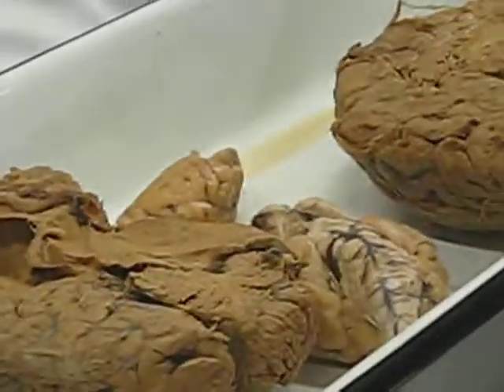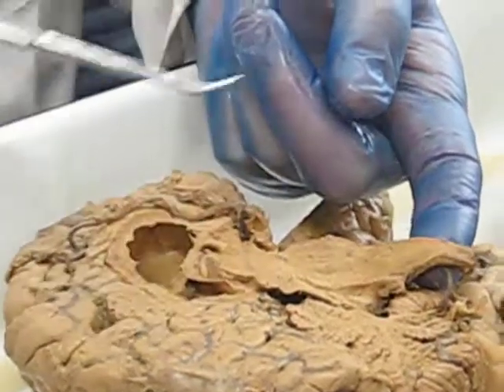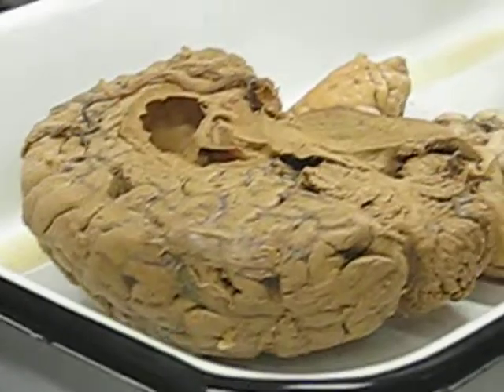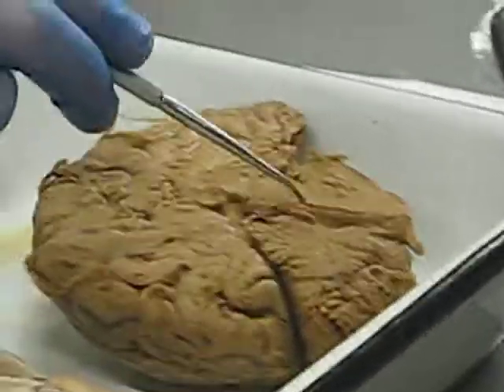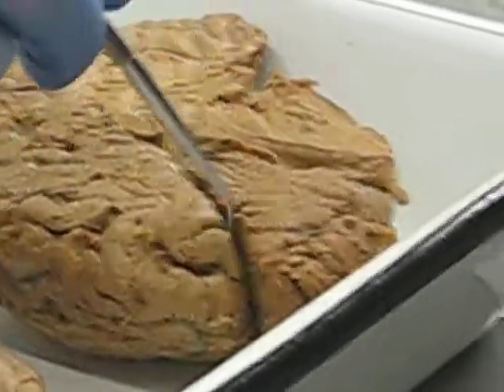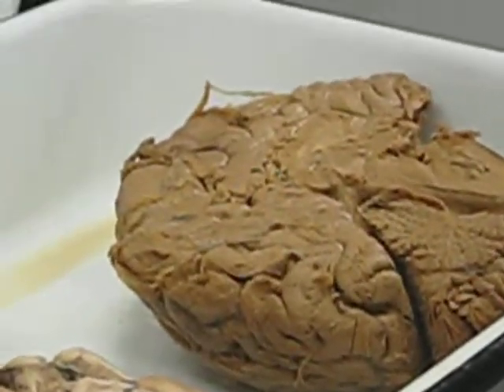But then the fourth ventricle has its own connection with the central canal of the spinal cord. So it's all connected. Velum, here's the fourth ventricle, that little flap there, that's the roof of the fourth ventricle. That's the velum. It contains the cerebrospinal fluid and doesn't let it wash out all over the place. All the above stuff is visible plus central sulcus.